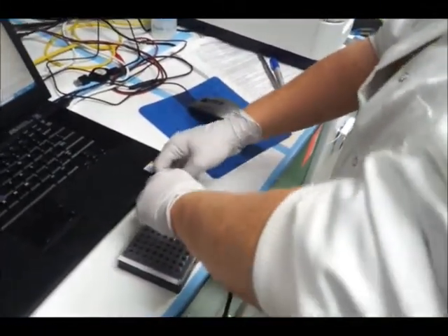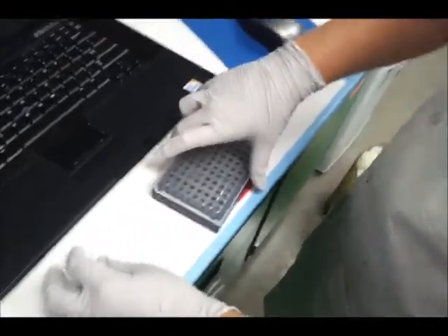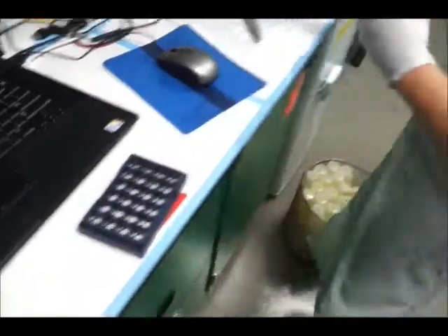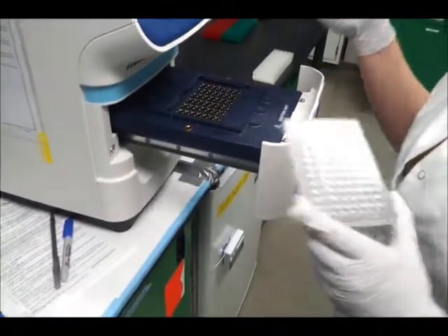So hold down the sides, take the white sides off. Keep the plastic film on, but take the sides off. This opens up like so. This is an old plate. This will get thrown out.